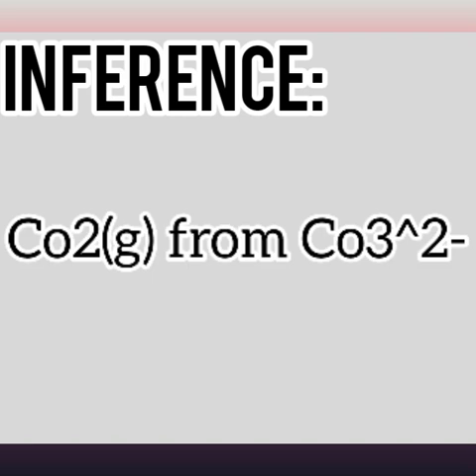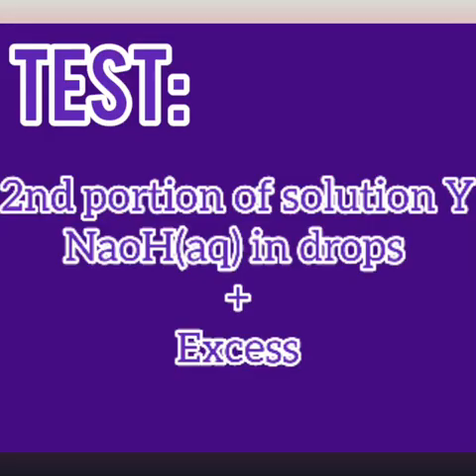That's why in the beginning I said either the first portion of solution Y plus X or dilute HCl plus solid sample of X, meaning that both of these tests would give you the same observation and the same inference. As earlier explained, any gas that turns lime water milky is going to be CO2. That's like the basic chemical law.